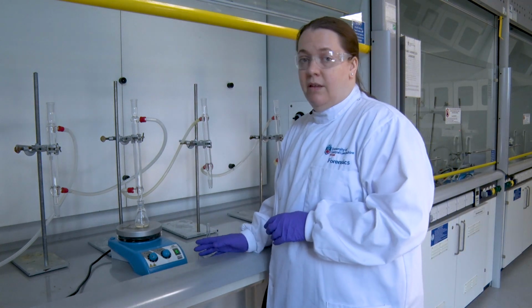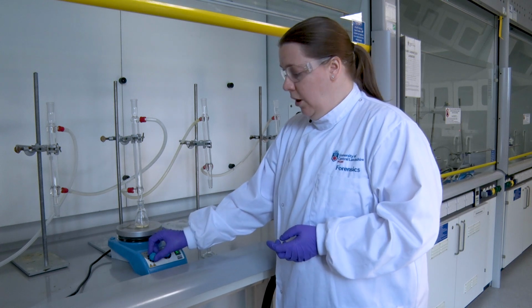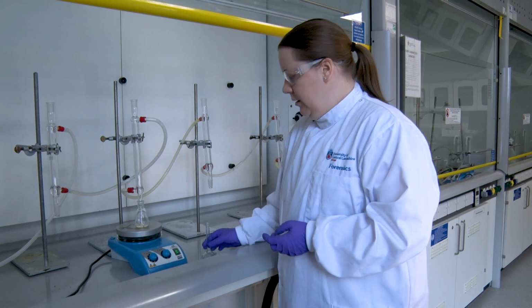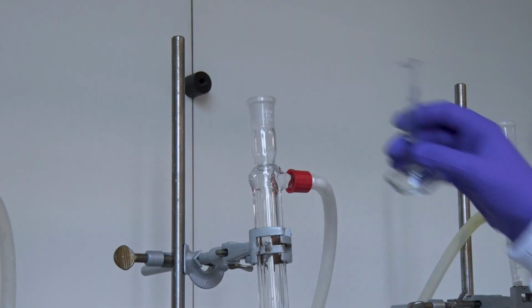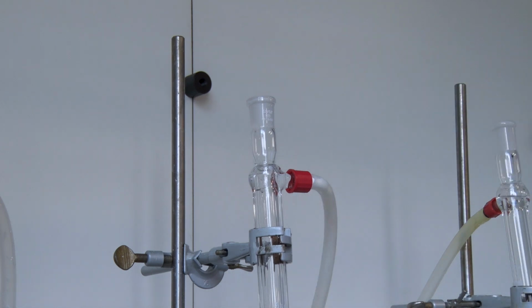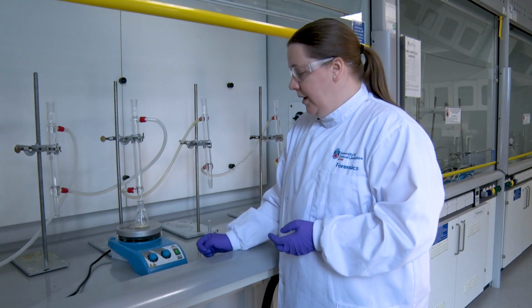It's now been refluxing for 20 minutes, it's time to stop. So turn your hot plate off, and without it cooling you're going to put your 2 mL of water down the condenser, and this gets rid of any unreacted acetic anhydride.